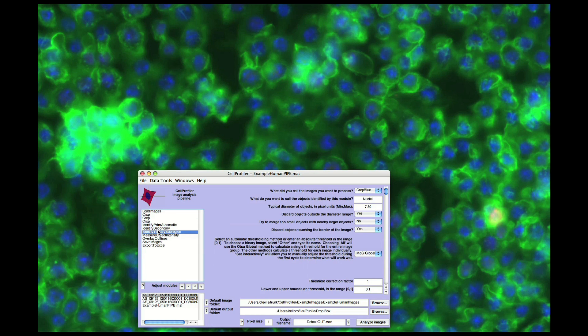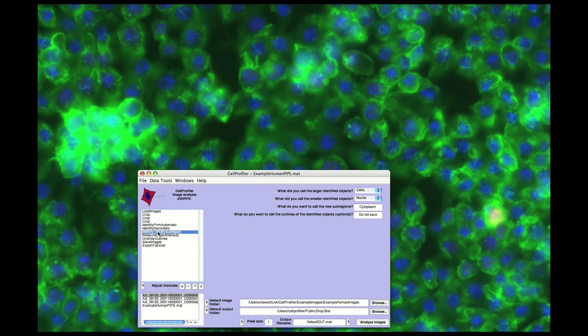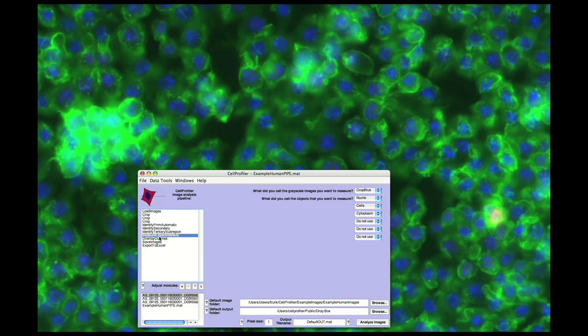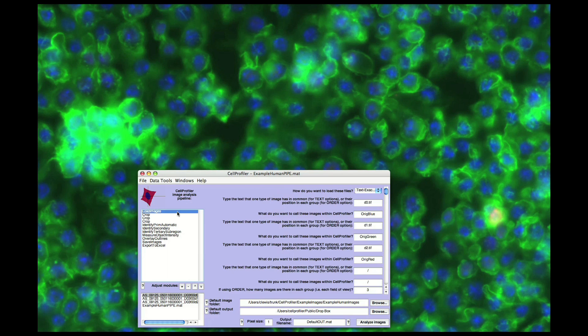You can see the individual modules in a pipeline in the list box to the left. As you click on each module, the corresponding parameters that can be adjusted are shown on the right. Each module is executed in order, starting from the top and working downwards.